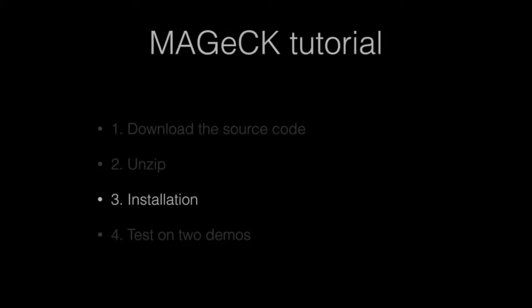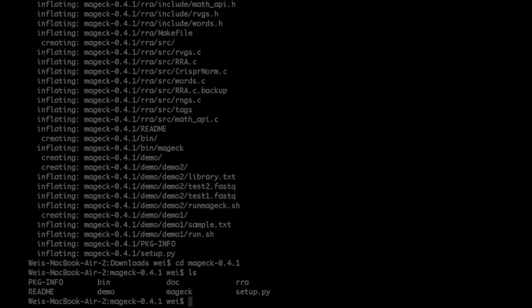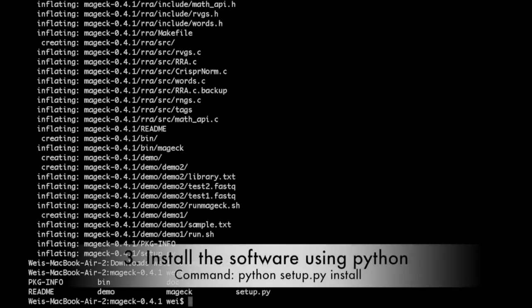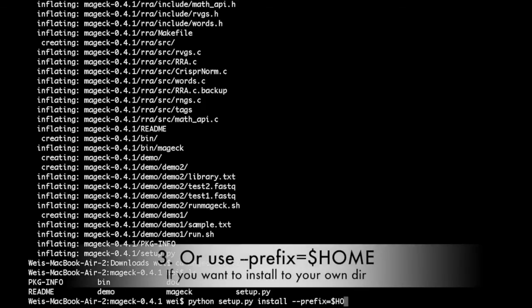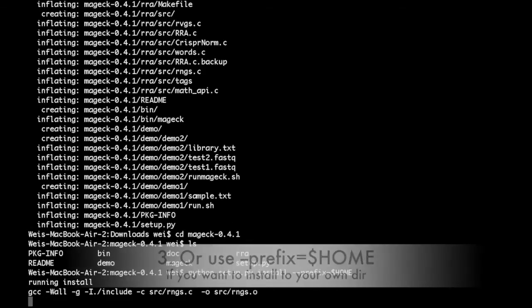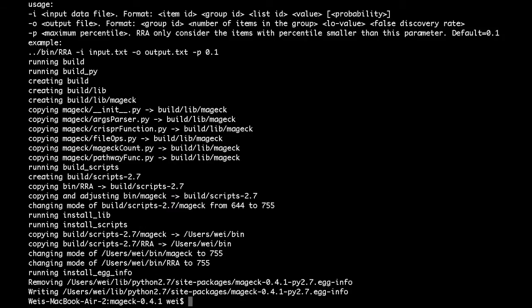The next step is installation. Go into the MAGIC directory and type "python setup.py install". If you want to install MAGIC to your own directory, as in this example, add an additional parameter to the command line to specify the location.